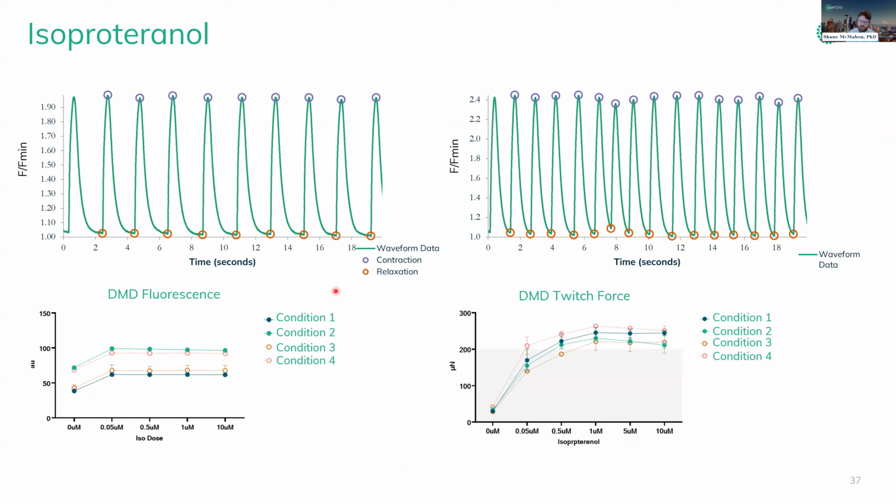In addition to acute ion channel blockers, we can look at compounds such as isoproterenol, which is a medication used to treat bradycardia. Isoproterenol is a non-selective beta adrenoreceptor agonist, and those receptors are from the GPCR receptor superfamily, which has a fairly complicated signaling cascade, but the end result is that stimulating that signaling pathway produces IP3, which binds to IP3 receptors on the endoplasmic reticulum, stimulating calcium release, which produces an increase in oscillation frequency and an increase in oscillation magnitude.